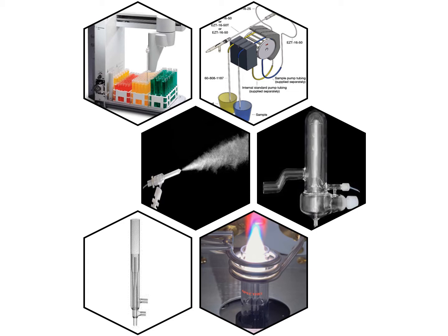Your sample is introduced up the middle tube, and then there's a tube around that, okay, which usually has a flow of argon gas. What happens is that there's a coil that goes around the whole thing, and through that coil you pass a very high frequency, so a radio frequency alternating current. Okay? And that creates a very strong electromagnetic field, and it basically just excites the argon atoms. So it works in exactly the same way as a microwave.